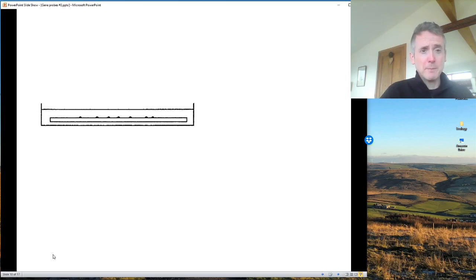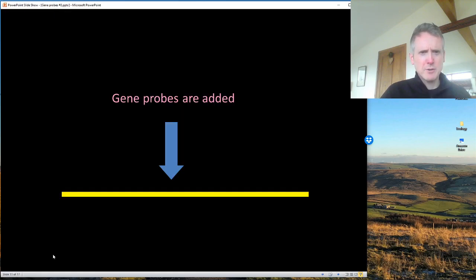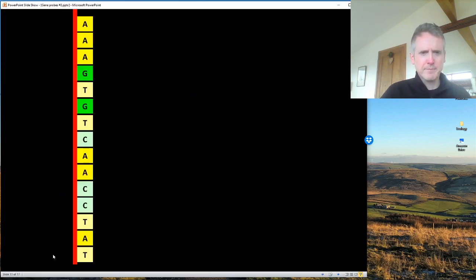Then we add the probe, and we'll see what a probe is. So the nylon filter is placed in a bath with radioactive gene probes. So you have to do this carefully because it's radioactive and damages the DNA. So yeah, probes are added.